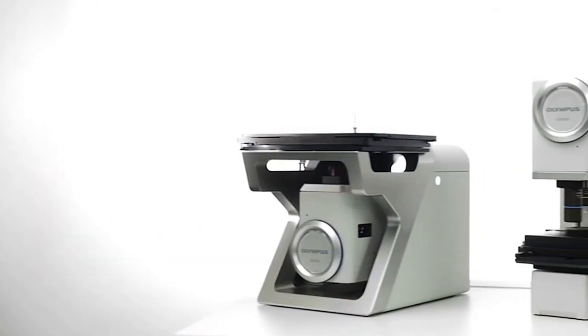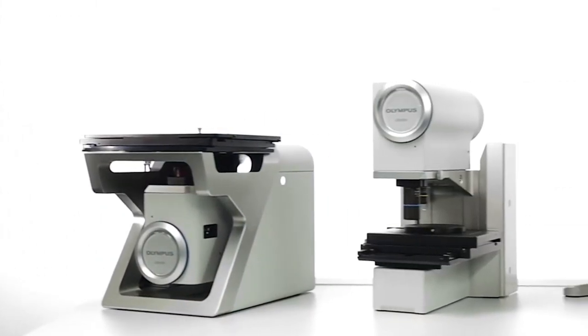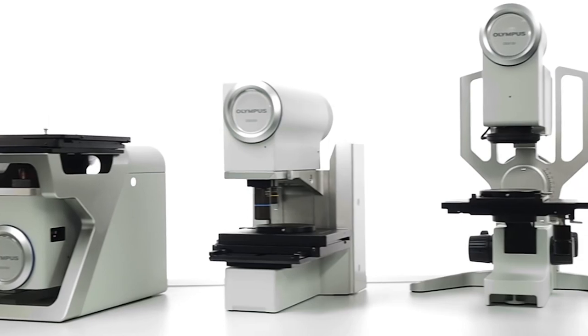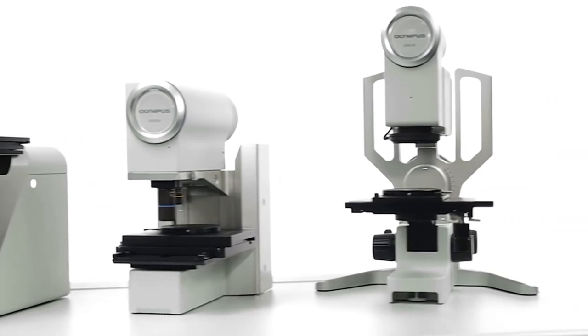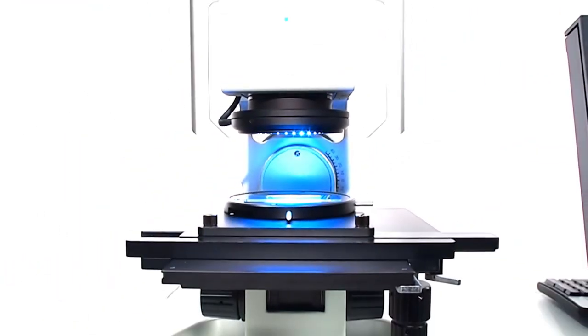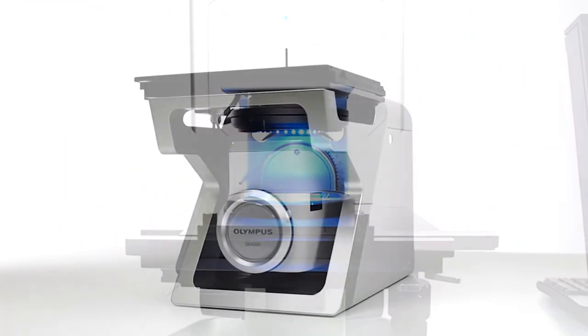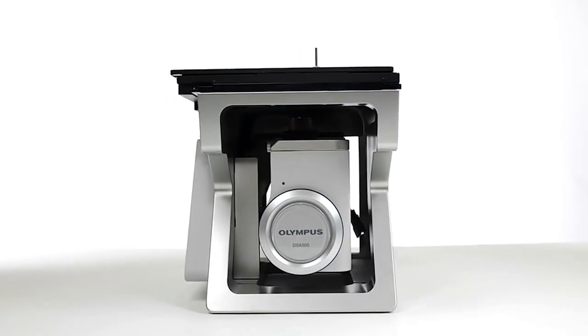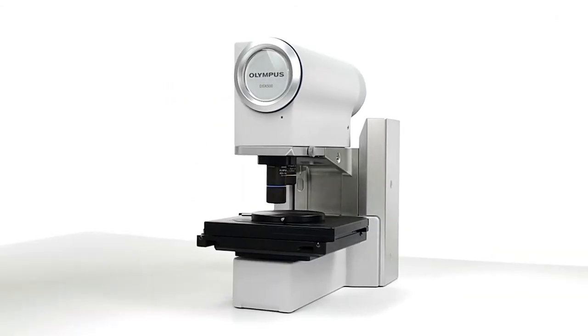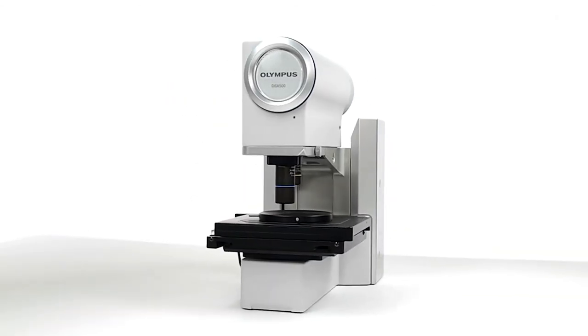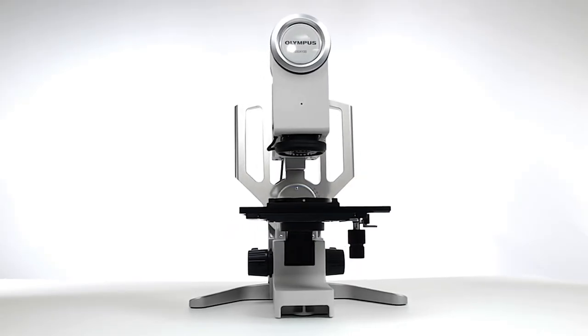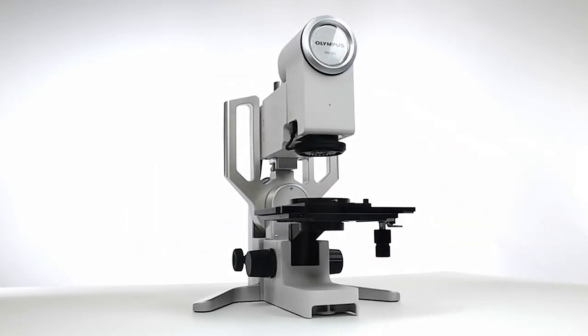DSX digital systems provide a new standard for micro-imaging and metrology with more than just a touch of sophisticated simplicity. They combine the best of both optical and digital technology, incorporating Olympus's world-renowned reliability with unmatched ease of use.